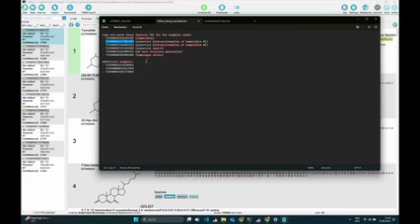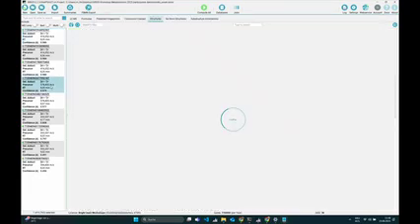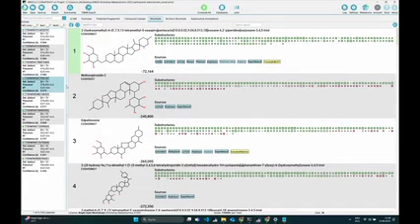If the filtering doesn't work for you, you can just copy paste this. This feature I wanted to show ends on 187, so we can just find it in the list and select it. Because we now looked a little bit at this tomatidine structure, you might see that this tomatidine structure is also present in this particular hit. This is the structure of tomatidine that we had before, and you have this added part to the left of it.